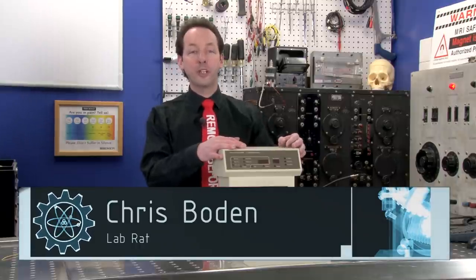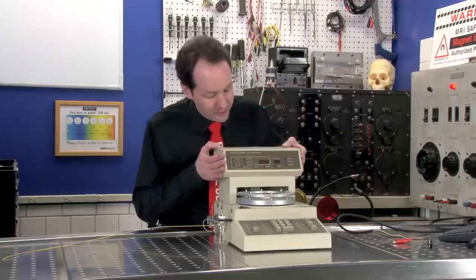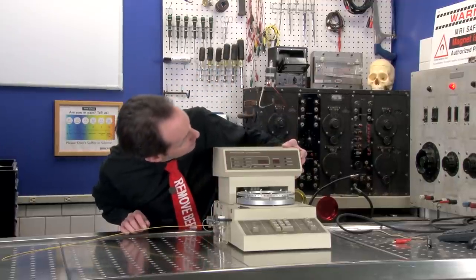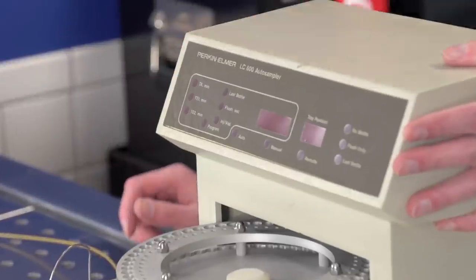Hi there guys, I'm Chris Bowden and welcome to the Geek Group. In today's equipment autopsy, we have this nifty thing which is a Perkin Elmer LC600 auto sampler.